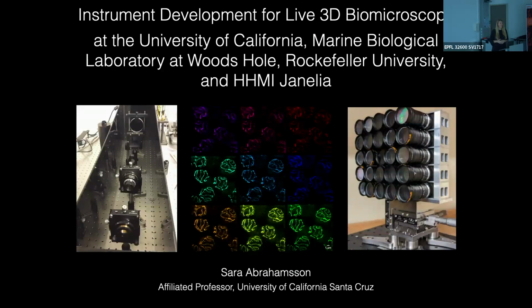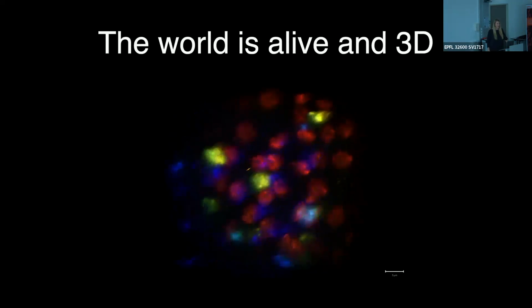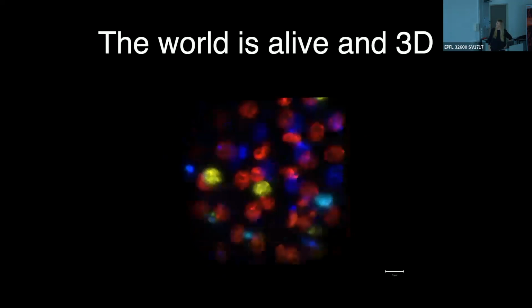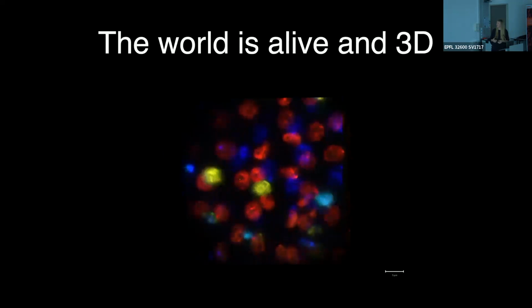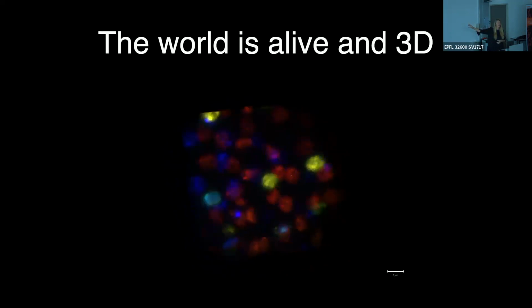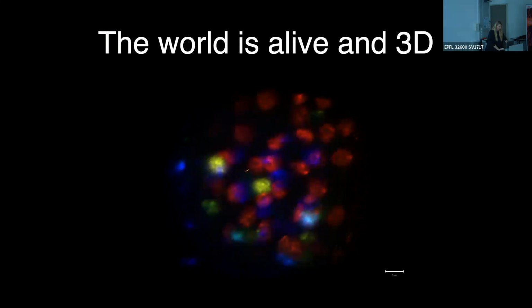I was lucky enough to now have my own PhD student the last 6 years, which means that I could realize some things that I hadn't really been able to do before, including this camera array, which I'll talk a little bit more about. It was really fun. So again, yes, it's more than 2 times as hard. It's at least 3 times as hard to do 3D, right? So here's an example of a Drosophila developing little embryo. And these are just what's going to be the heart cell beating, just to show that this is 3-dimensional imaging. And all of this 3D data is captured simultaneously because we are multiplexing the beam into a 3D image. That was kind of the key there.